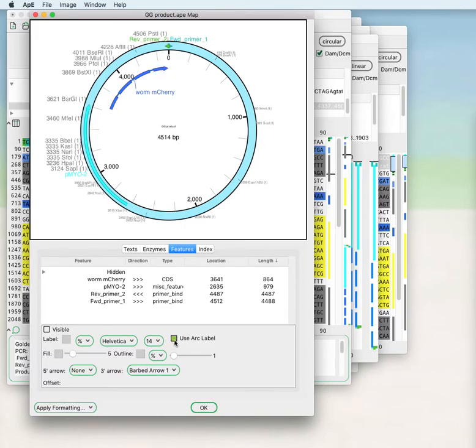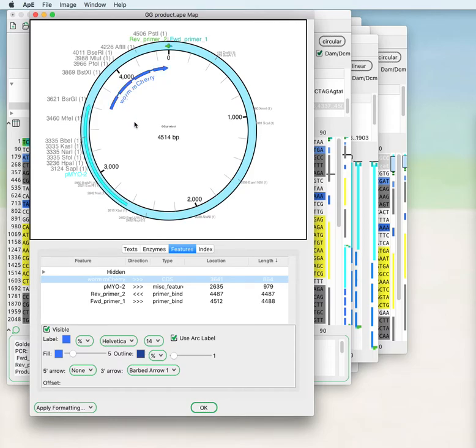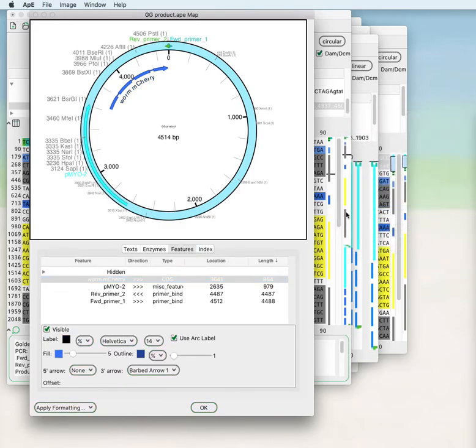You can change the feature so that it uses an arc label instead of the horizontal label. You can change the color of the label and the font size.